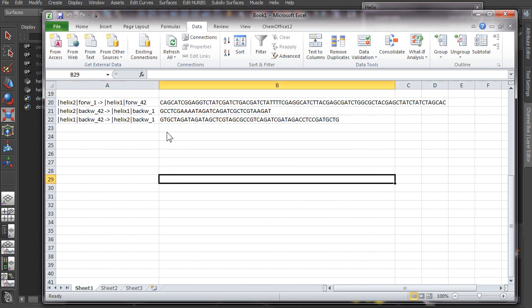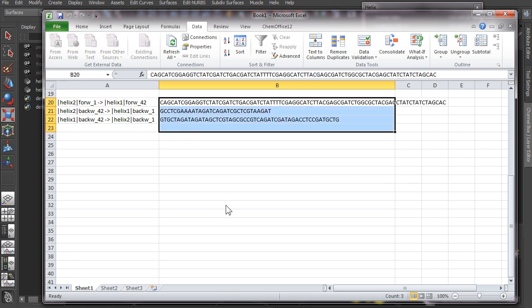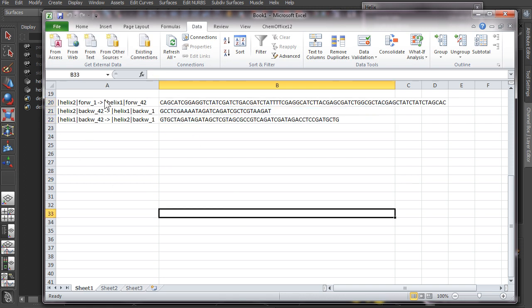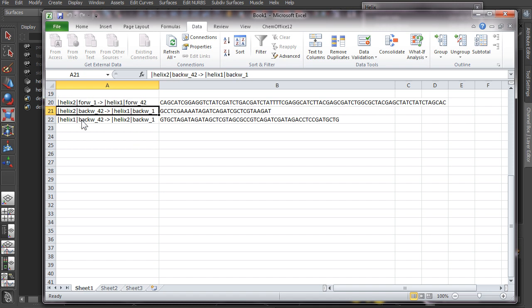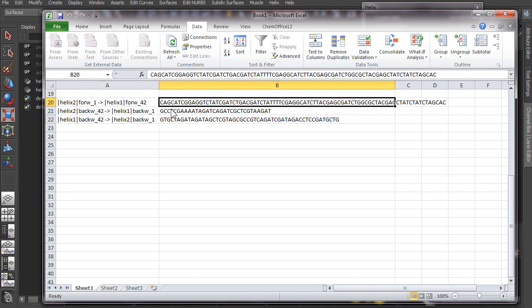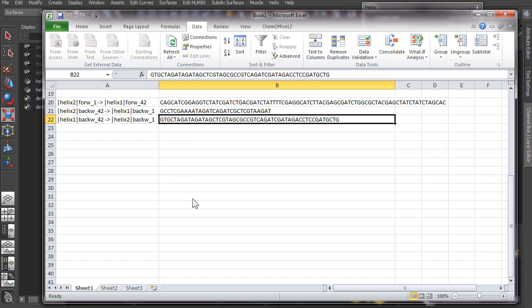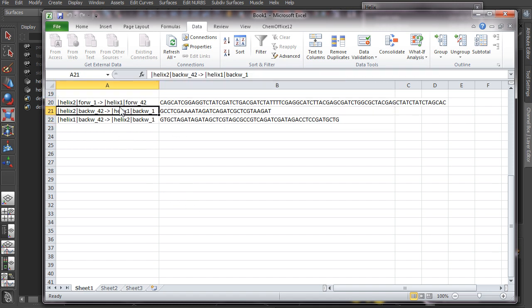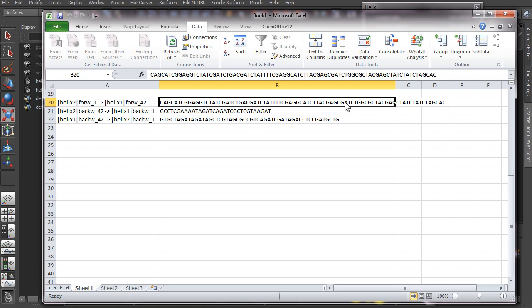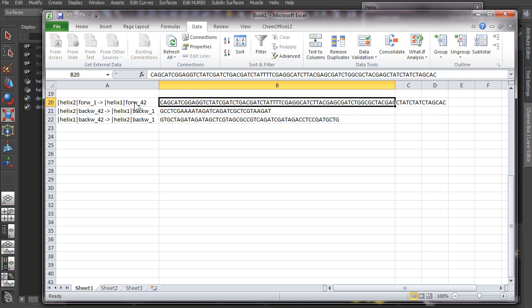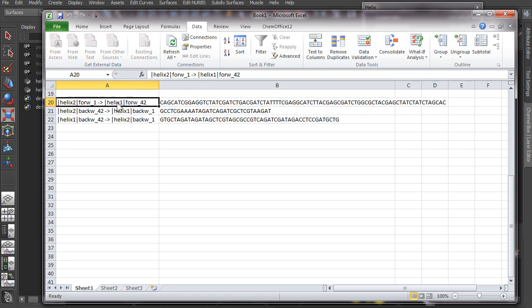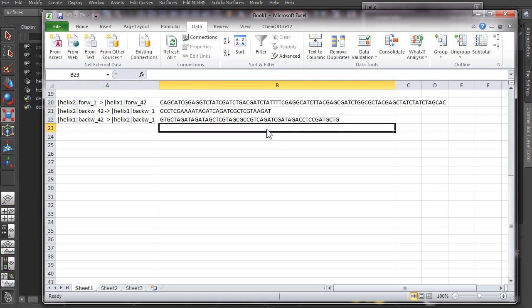And then we get the strands out in an easy way where you can also see the starting points of every strand and this is the sequence that you have for each strand. Now if you're doing something like an origami design, by default this will also output the scaffold since it's outputting all the strands. So you just discard the longest one if you don't want to order that of course.